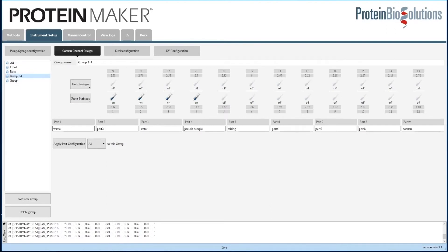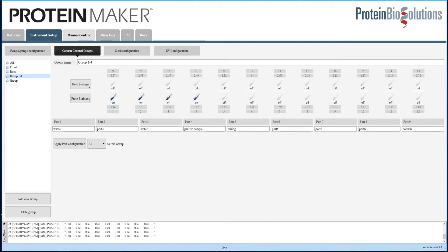We can label the port positions. For example, here we see ProteinSample is labeled as the port 4, so that when you're building a method, the actual name of the fluid, rather than the port number, is displayed for you to see.